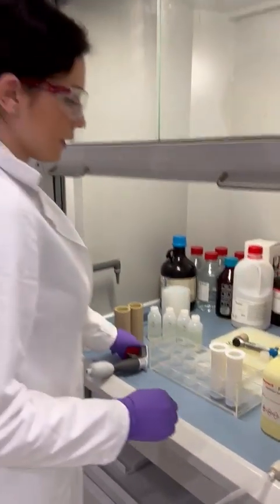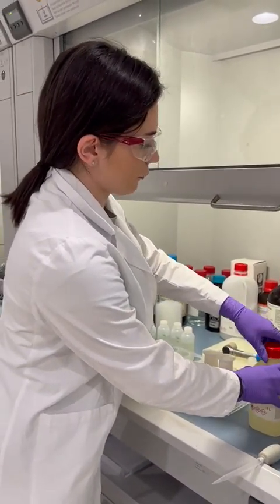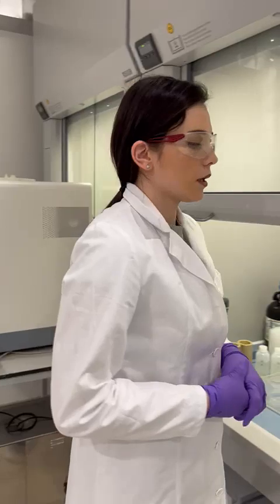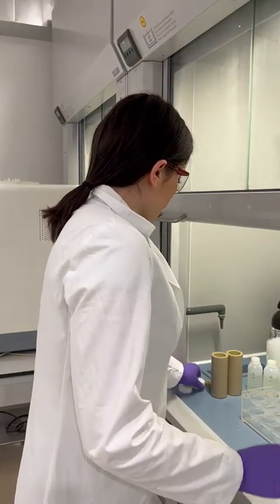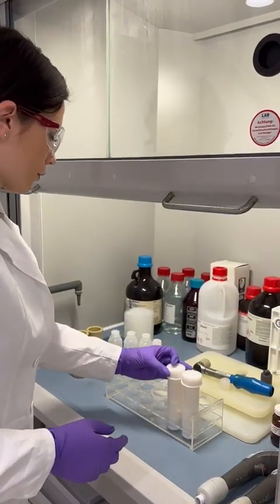After that, we are adding 1 milliliter of hydrochloric acid and 1 milliliter of hydrofluoric acid. After that, we are closing our microwave vessels — first we do this step of closing the vessels.